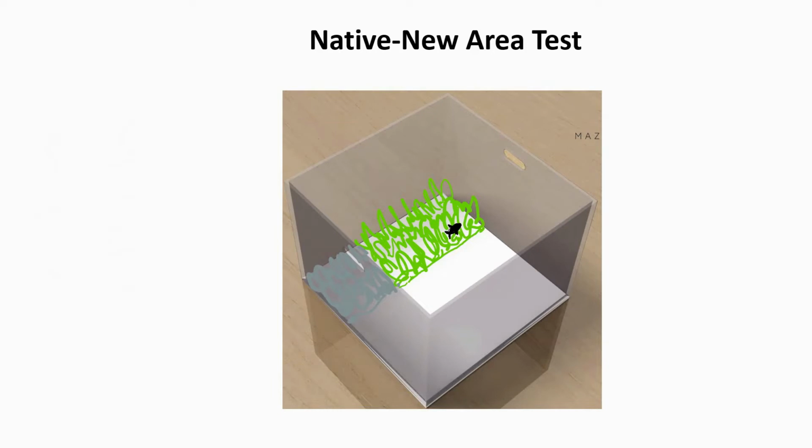When you bring your fishes from the vendor, you must have kept those fishes in certain conditions, and you acclimatize your fishes to those conditions. If you're keeping your fishes in this region, your fish is accustomed to the pebbles and the plants. But if you have kept your fish in a blank tank, then your fish is more comfortable in a place which doesn't have pebbles.